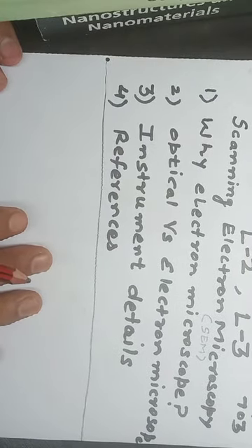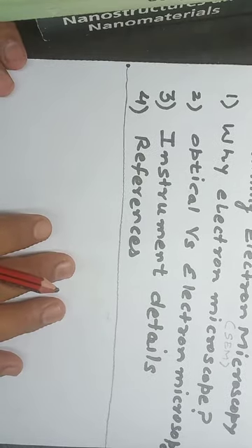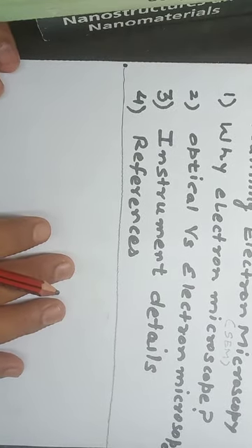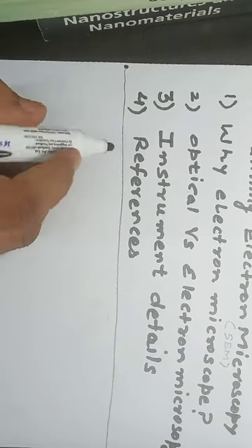Before introducing these electron and optical microscopes, I would like to make one point: often we come across two terms.